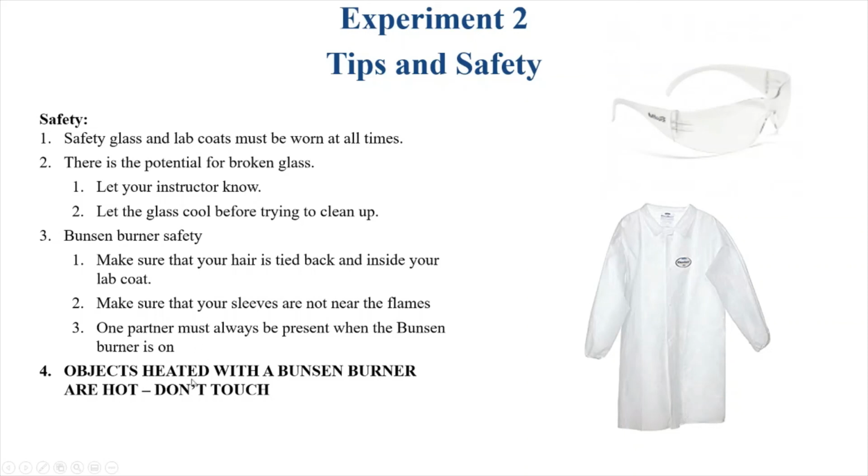And just to give you an anecdotal story about this, I always tell my students this, and I'm shocked when they do things. Objects heated with a Bunsen burner are hot, don't touch. In several instances, I've had students do this. In one instance, I had a student try to take an evaporating dish off of the Bunsen burner with their hands. They didn't get very far. They touched it a little bit, and they realized it was very hot. And then they knocked it off, and it broke into a bunch of pieces.